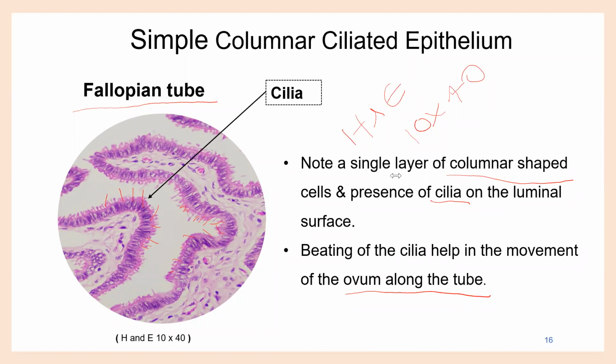Are there cuboidal epithelium and microvilli in the proximal convoluted tubule, right? The proximal convoluted tubule of the nephron has tall cuboidal cells with microvilli. Okay, yes. Stereocilia are found only in the epididymis and the vas deferens, right? Yes, correct.